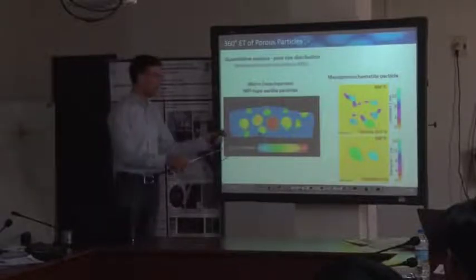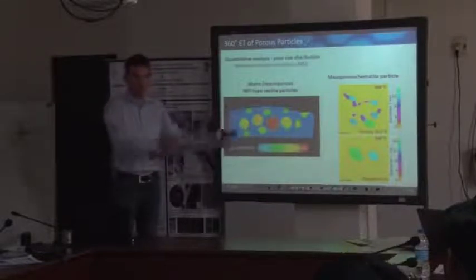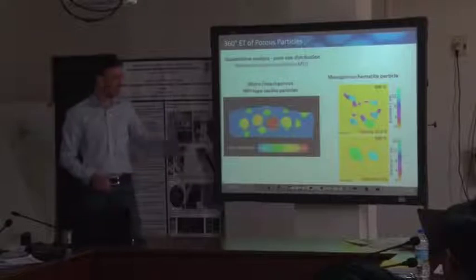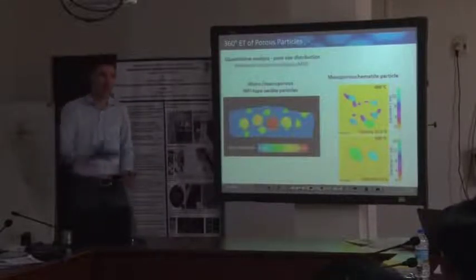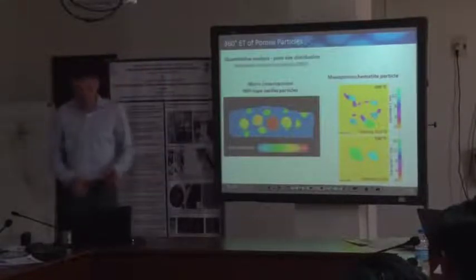And you have to keep in mind that this was only a single measurement of an individual particle. If you want to gain some insight, if you have a very heterogeneous distribution of properties of particles, I mean, this is very homogeneous material, then you have to think about how many structures or how many samples or particles you would have to measure.